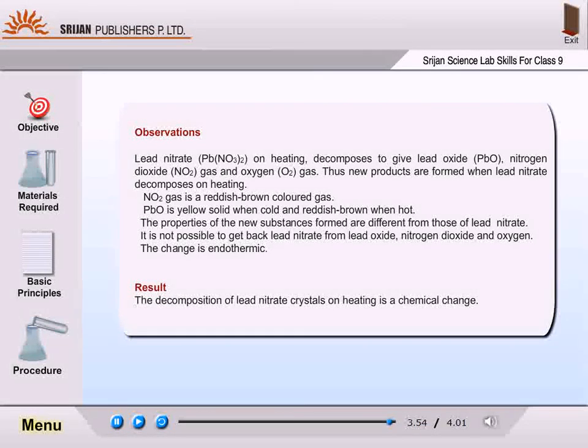Result: The decomposition of lead nitrate crystals on heating is a chemical change.